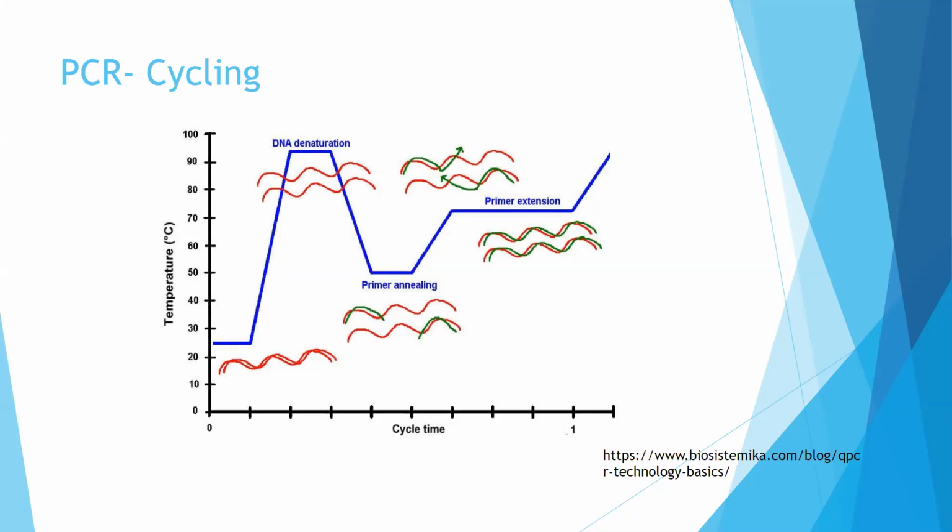In the extension step, DNA polymerase synthesizes new strands. When the polymerase reaches a TaqMan probe, it will cleave the probe, separating the dye from the quencher. Each cycle will have more dye release to increase fluorescence intensity. This method allows the estimation of the amount of a given sequence present in a sample. For each strand of DNA amplified, a fluorescent molecule is produced.